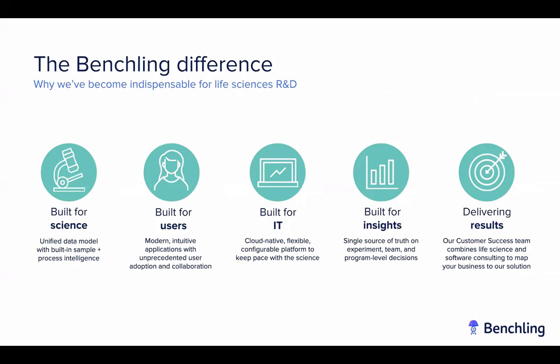We're built for insights insofar as you can track anything that ever occurs to the molecules that you work with, ranging from their design, to where they came from, to how they're used in assay and screening, to their sequencing results, all the way down throughout the process. And we have a customer success team who works with you to actually map your science to the solution.